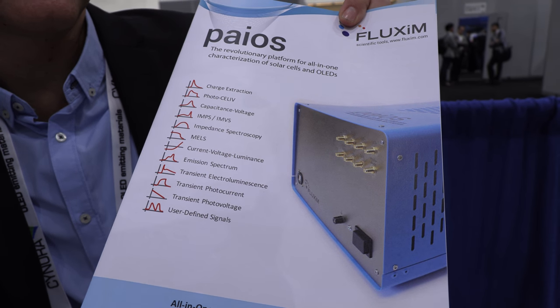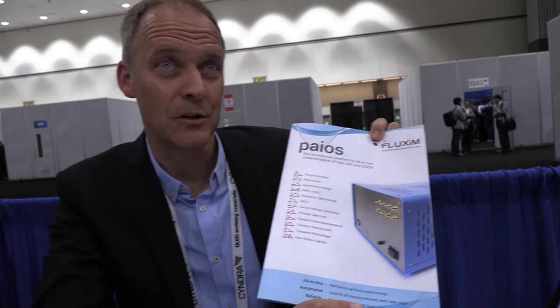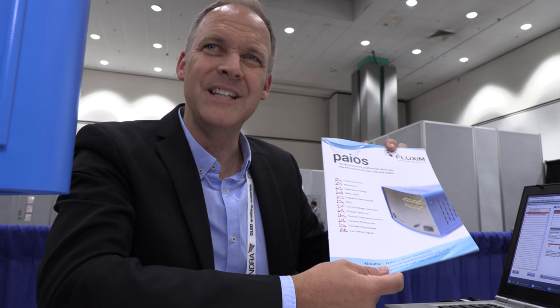We have already sold several dozens of these equipments to the worldwide OLED and solar cell industry. So all the researchers that make next generation solar cells or OLEDs, they can benefit from a very easy to use and very fast and reliable equipment.